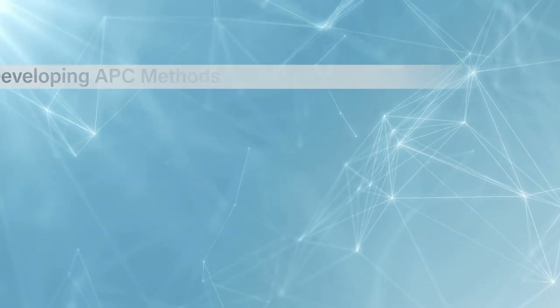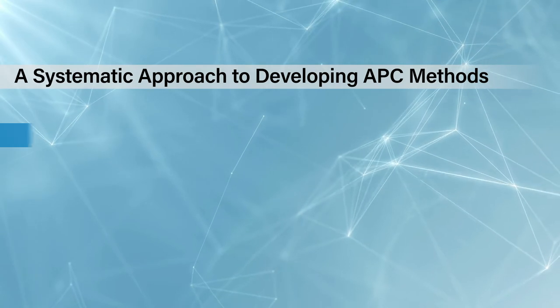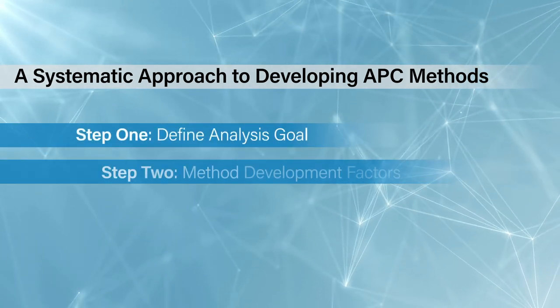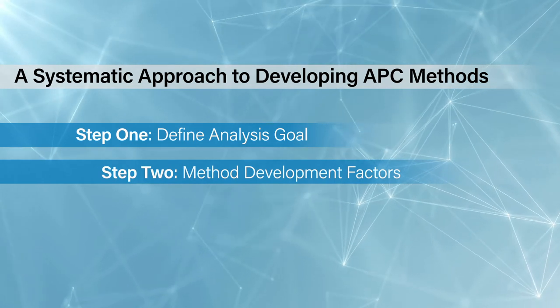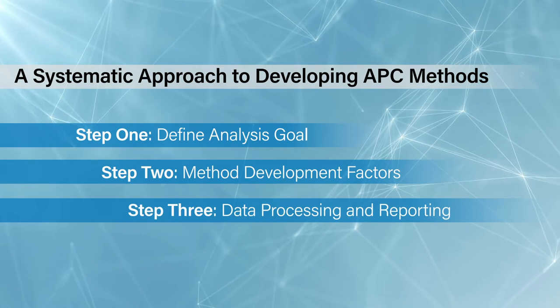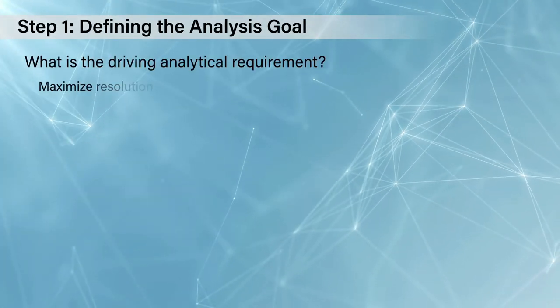We're going to take a systematic approach to developing the APC methodology. First of all, we're going to define the analysis goal. Then we're going to look at the method development factors, and finally the data processing and reporting options available to us. So what is the driving analytical requirement?